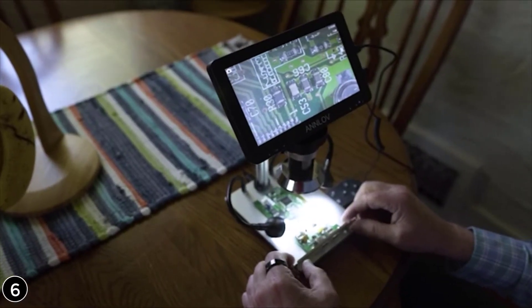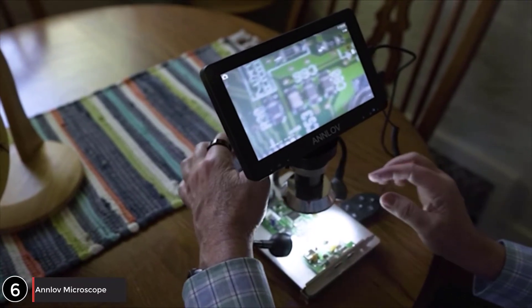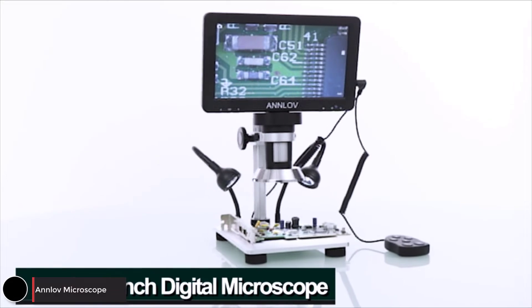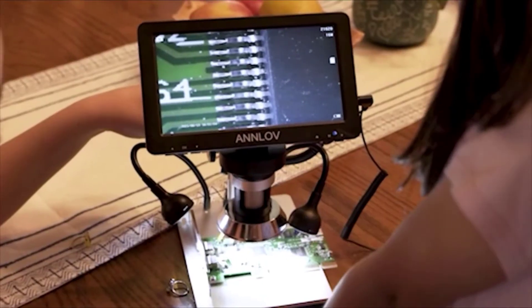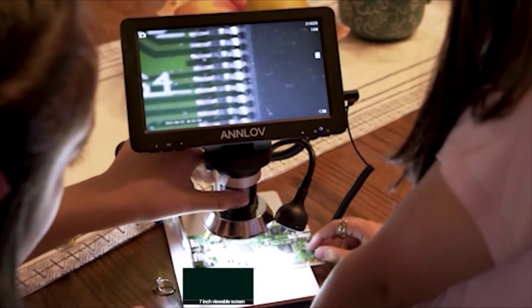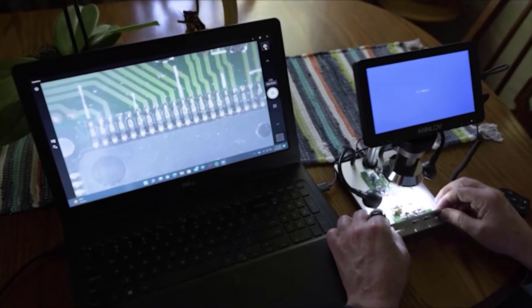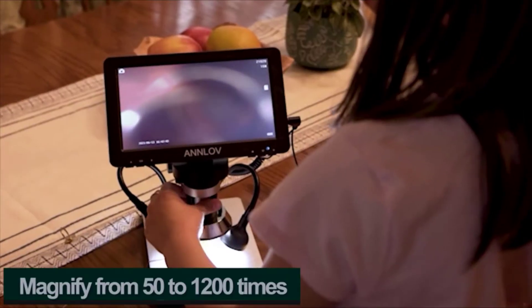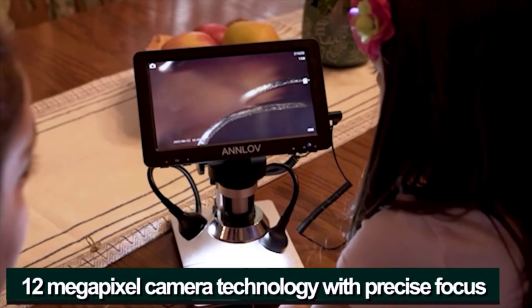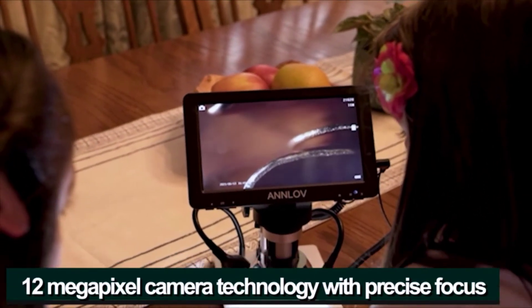Microscopes are a great tool to have, but having to only look through the eyepiece can be difficult. Here is a better way to view the macro world. This is the Anlov 7-inch digital microscope. The powerful microscope includes a 7-inch viewable screen so everyone can see what you're looking at, and can also connect to a computer or laptop for an even bigger viewing area. Magnify from 50 to 1,200 times, and it has 12-megapixel camera technology with precise focus for clear pictures and video.